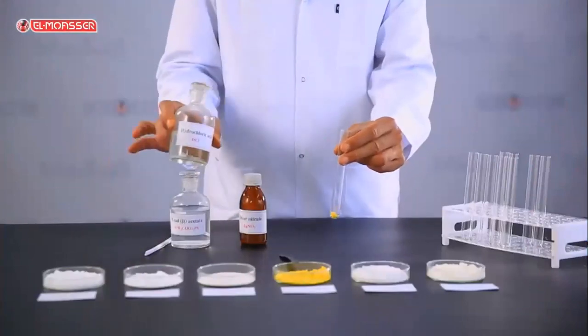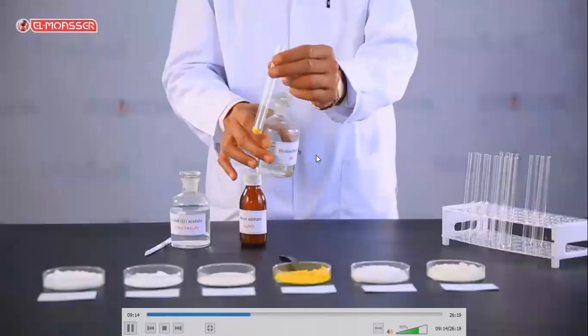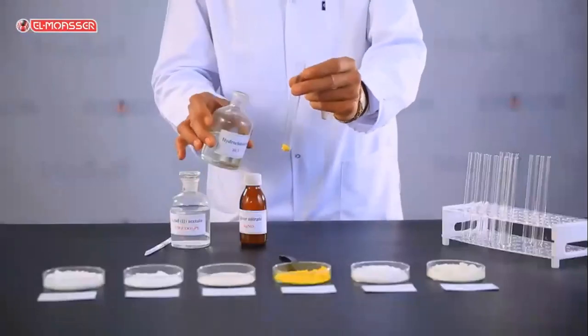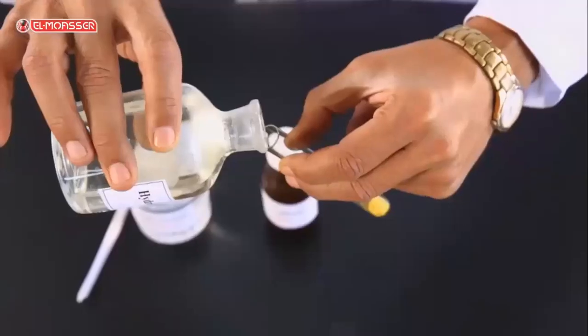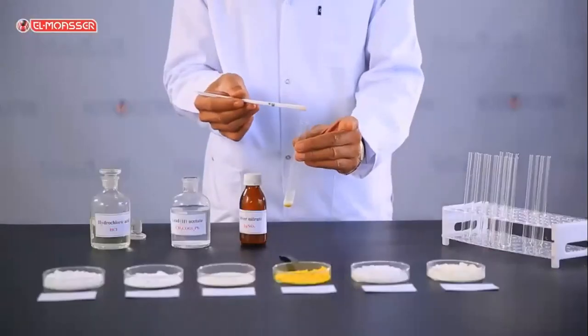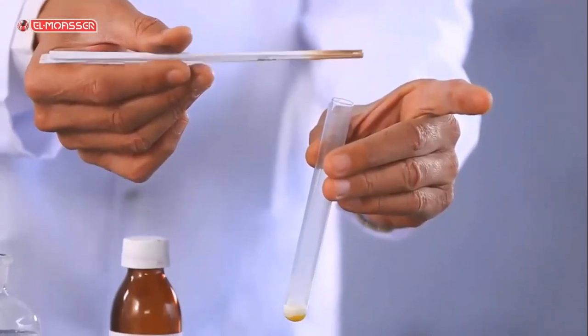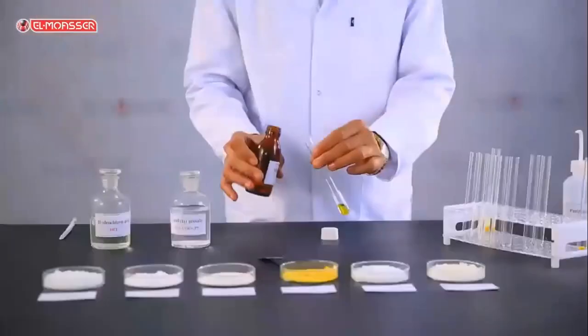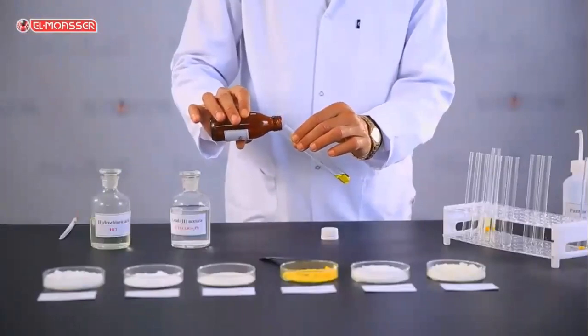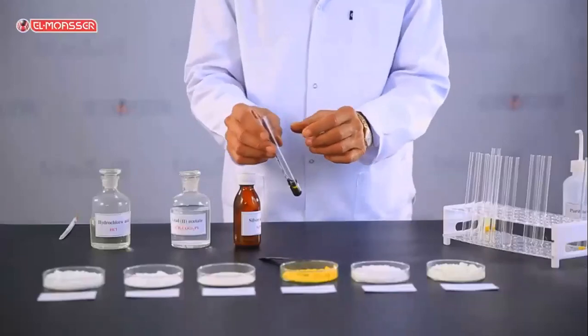Summary. On adding diluted hydrochloric acid to sodium sulfide salt, hydrogen sulfide gas evolves, which turns a paper wetted with lead acetate into black. And on adding silver nitrate solution to sodium sulfide solution, a black precipitate is formed.